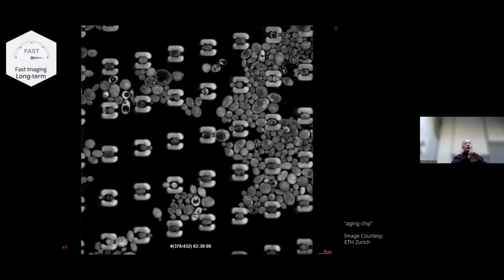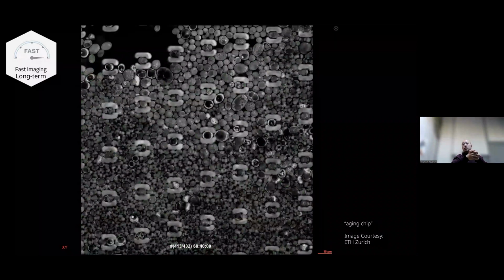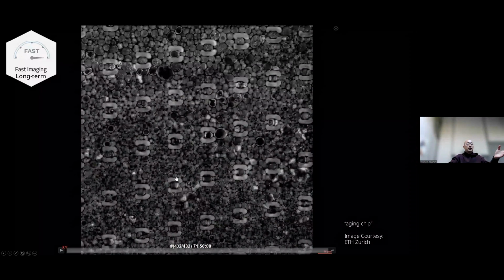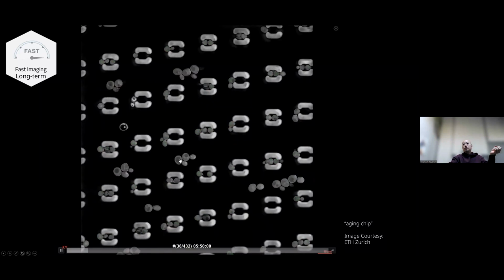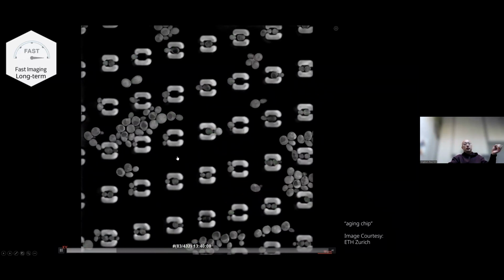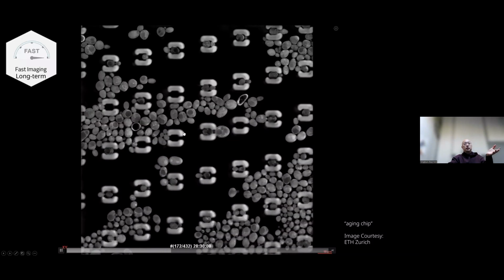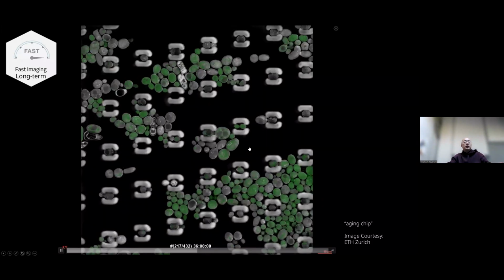Without any issues of vibration and stability, you can nicely track those dynamics with high resolution using this microfluidic device, for investigations of structural information over a few days and up to a week.